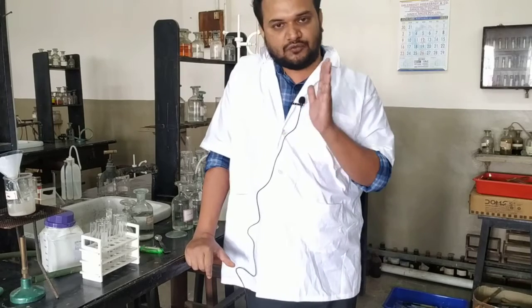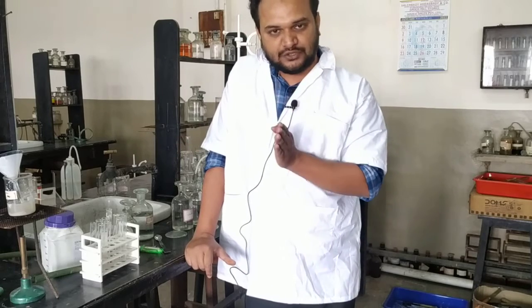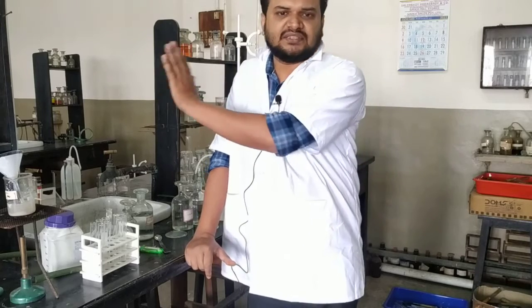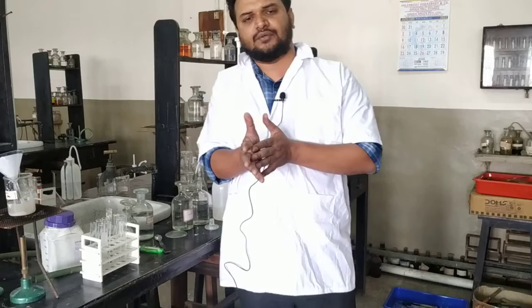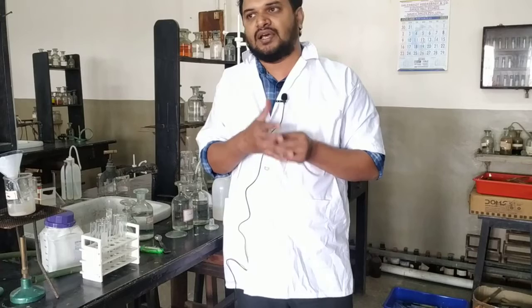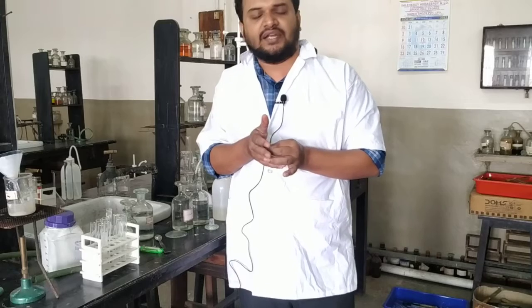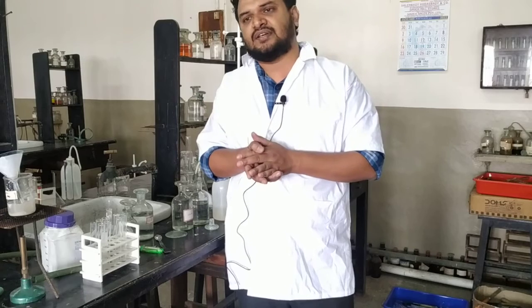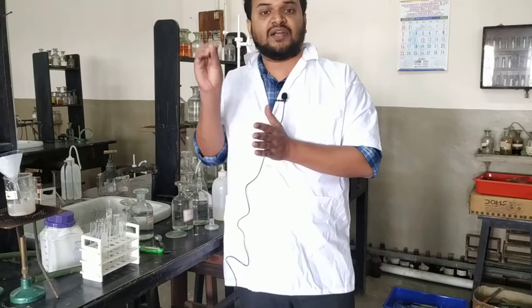For anion, you have to write the preliminary. First you will write how you have prepared the sodium carbonate extract, then you will write heated with dilute H2SO4, no gas with characteristic smell or color obtained. So these anions are absent. Those anions which give you a characteristic observation on heating with dilute H2SO4 may be absent. Then heating with concentrated H2SO4, again no characteristic observation. So other anions which give observations when heated with concentrated H2SO4 are absent, like nitrate absent, nitrite absent, etc. Then from these two experiments you get an idea that sulfate may be present.